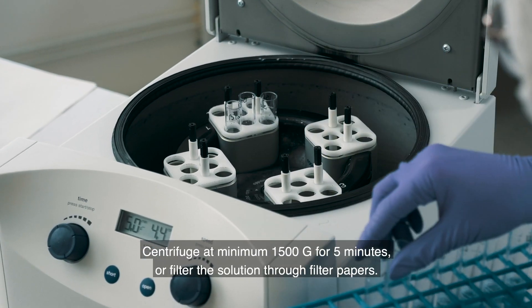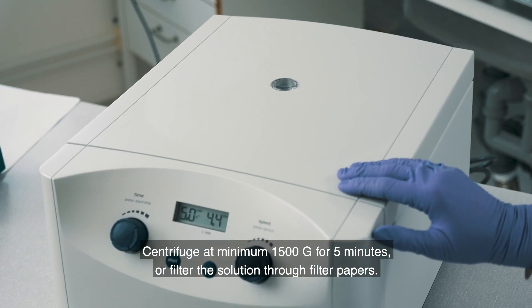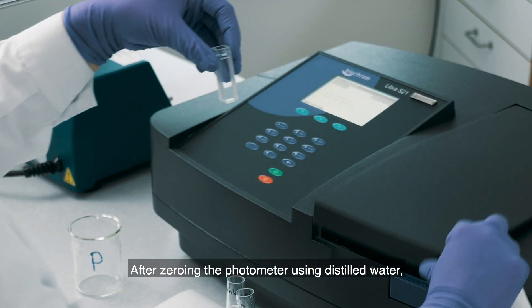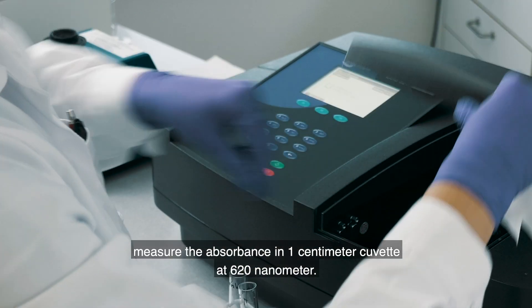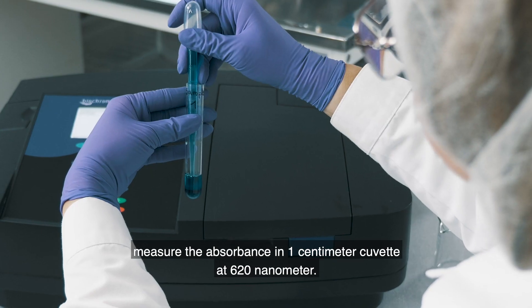Centrifuge at minimum 1500g for 5 minutes, or filter the solution through filter papers. After zeroing the photometer using distilled water, measure the absorbance in a 1 cm cuvette at 620 nm.